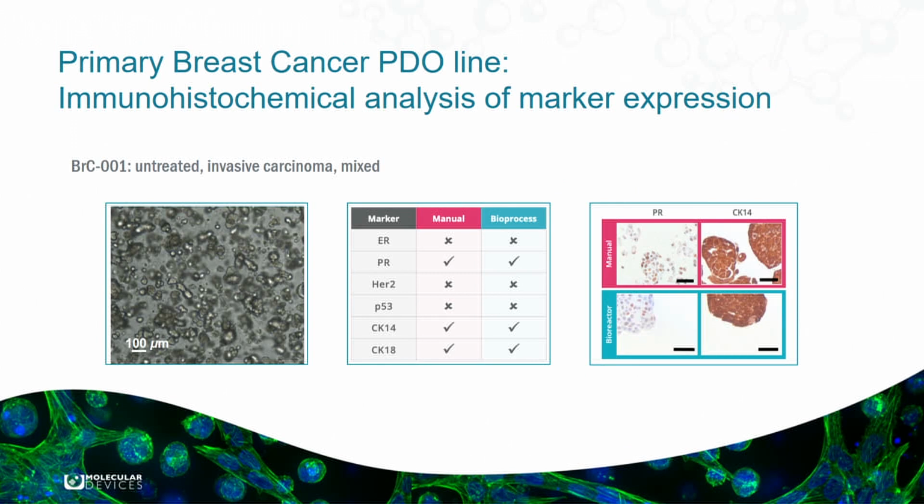So the organoid line that we did for this experiment, so actually we tested 3 different breast cancer lines. I'm just presenting the data today of one of those lines. On the left is a bright field image of what the organoid looks like in culture, so you can see it's a really nice, healthy growing line. I think this was actually an image of one of the bioreactors in culture, so really dense, very happy growing.